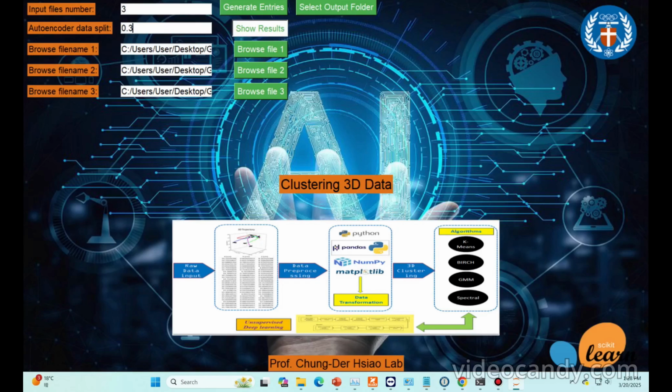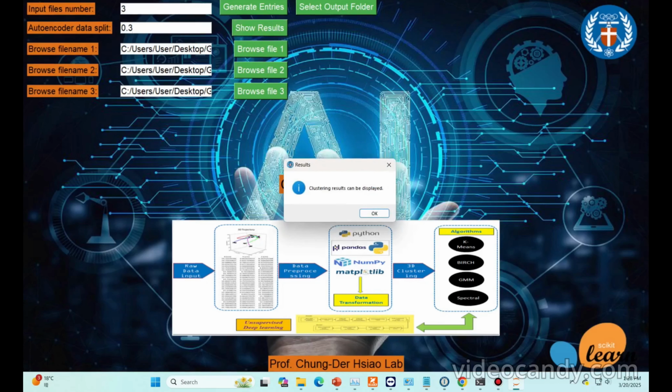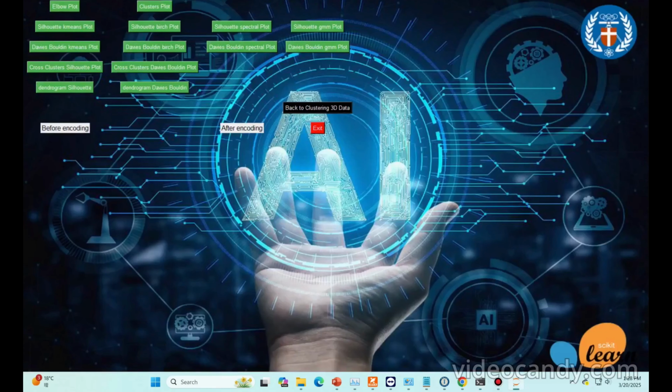And now you will see the output. Potentially it varies.